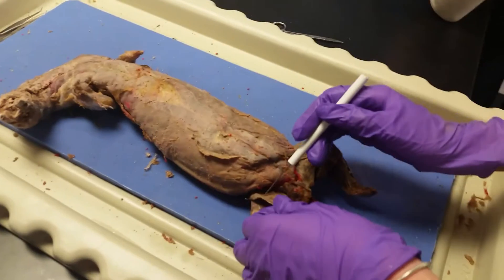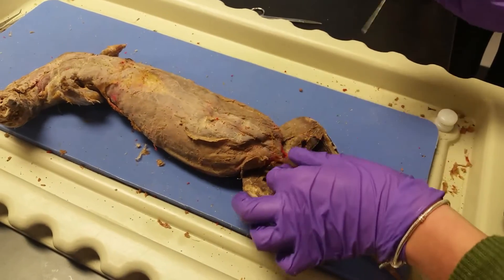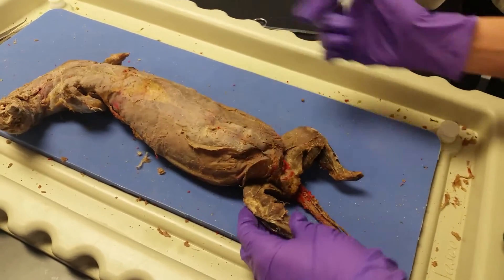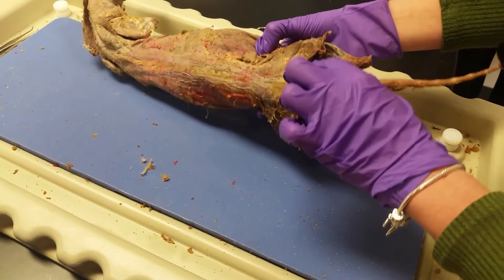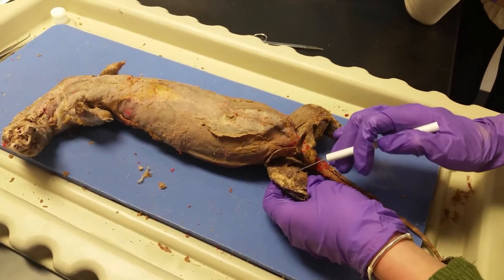Here we have the sartorius muscle. It has been cut from the mink. And then we have the gracilis, which goes all the way here. Here we have the semitendinosus that goes all the way and wraps around to this side of the mink over here. We have the semimembranosus.